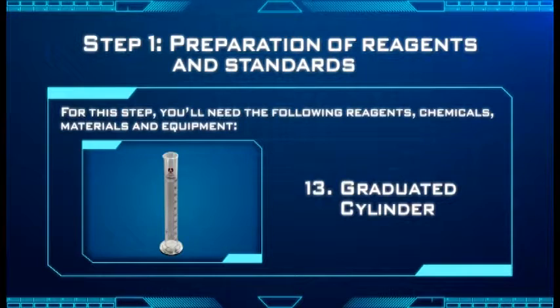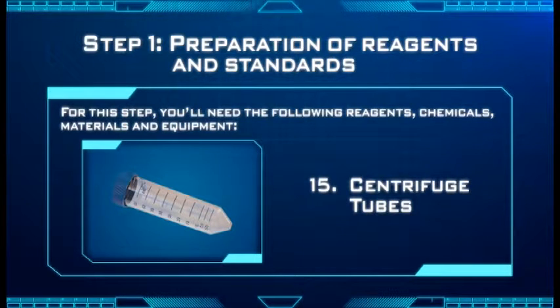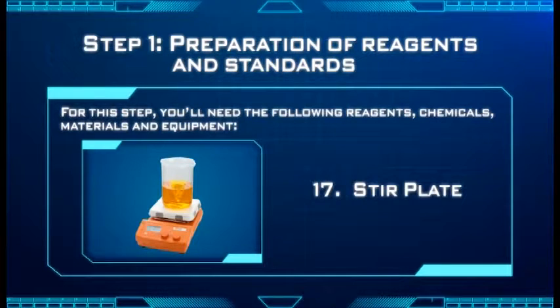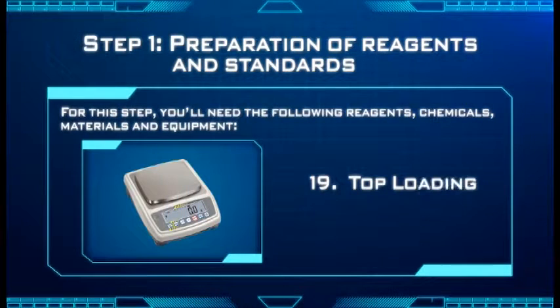Graduated cylinder. 14. Titer tubes or dilution tubes. 15. Centrifuge tubes. 16. Single and multi-channel pipettors. 17. Stir plate. 18. pH meter. And 19. A top loading balance.